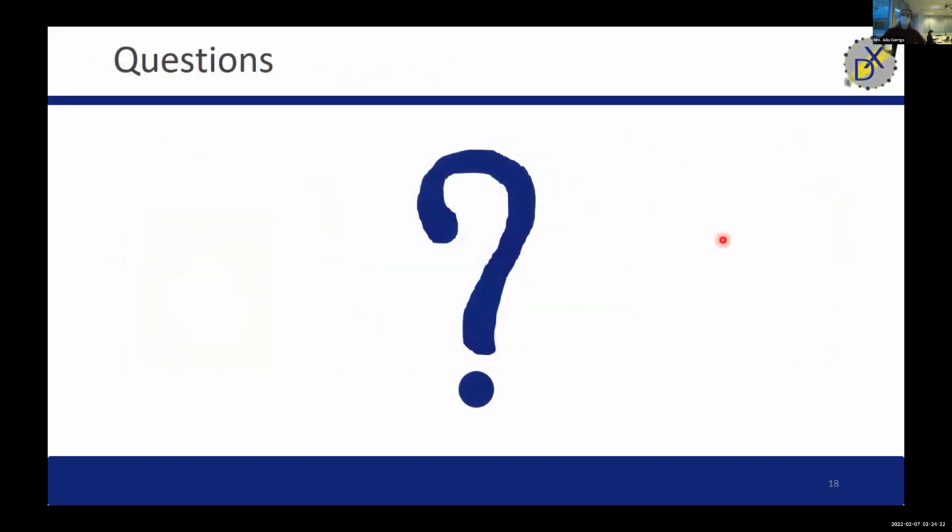Okay, so after having talked a bit about the preprocessing, and also what Raquel has explained, if you have any questions about this part, we can answer them now, and then we can continue with the second part of the presentation. We can start with Emilio's question that was written in chat.